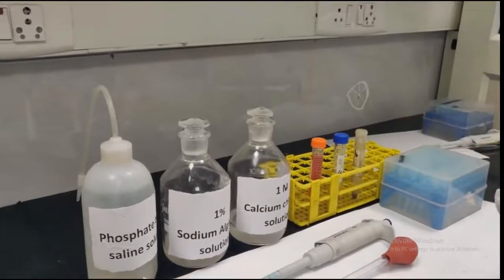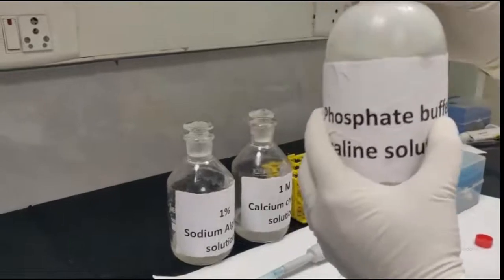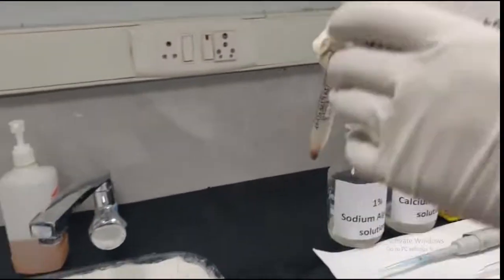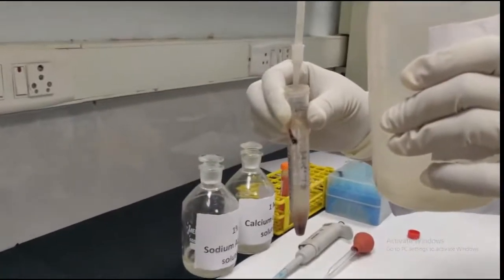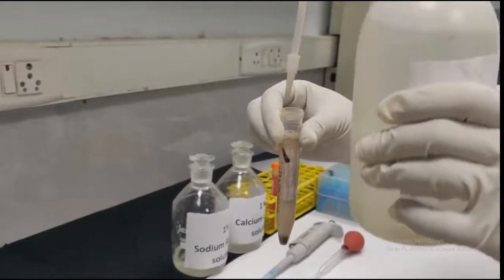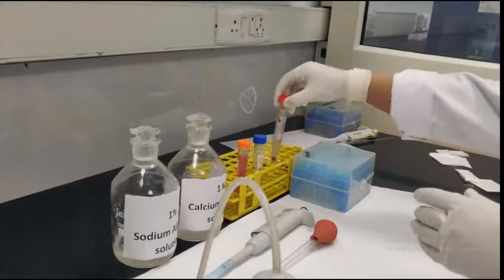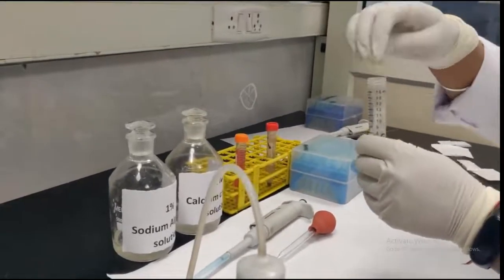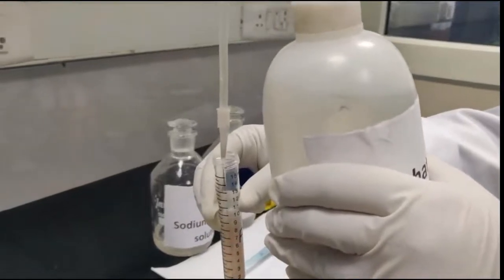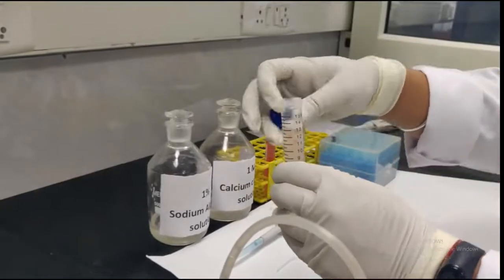This washing will be done using the phosphate buffered saline, and this PBS solution will be added into the tube. So similarly, it will be added into the next sample. So this washing is basically done to remove the formalin residues so that they don't interfere with the staining later on. So now we have added phosphate buffered saline.